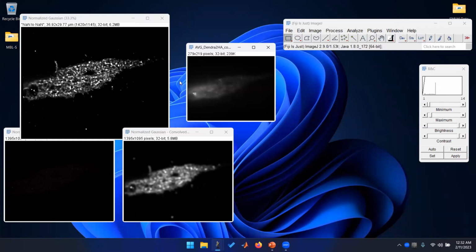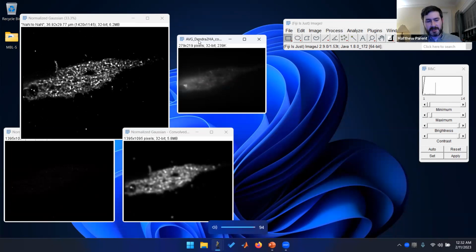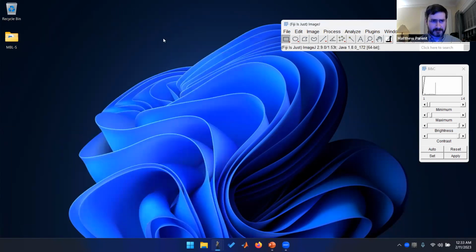Hi, sir. I have a doubt. How do you calculate background for each and every molecule? Background, yeah. I didn't talk much about background. There are a lot of different ways to calculate background. The one that I prefer is something called a temporal median filter. You can't access it from Fiji as far as I'm aware, but essentially what you do is you take your raw stack. Let me reopen it so I can show you.